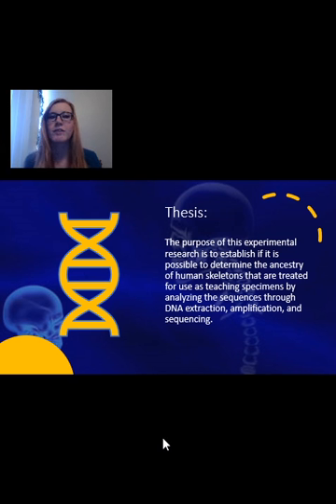So the purpose of this experimental research is to establish if it is possible to determine the ancestry of human skeletons that are treated for use as teaching specimens through DNA extraction, amplification, and sequencing.